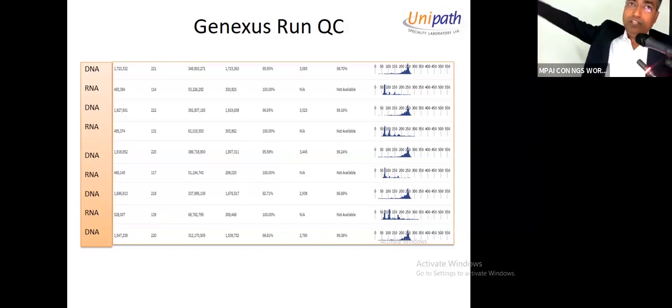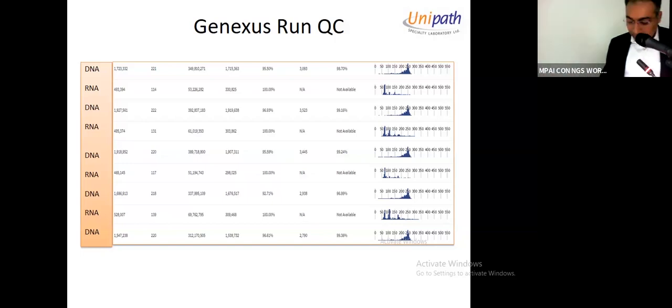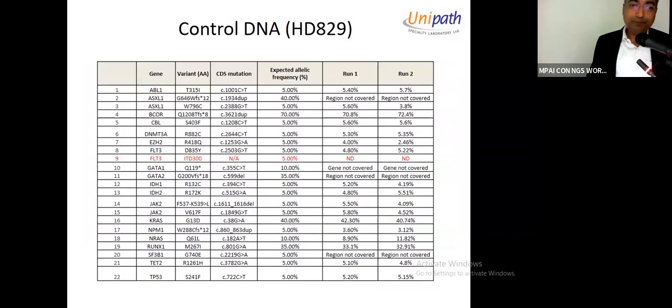This is just a QC coverage. Green is very nice. Whatever I'm getting is very nice. Subsequently, when we look at the variants, it is good data for me to analyze. And I can confidently report, okay, my data is good to go.